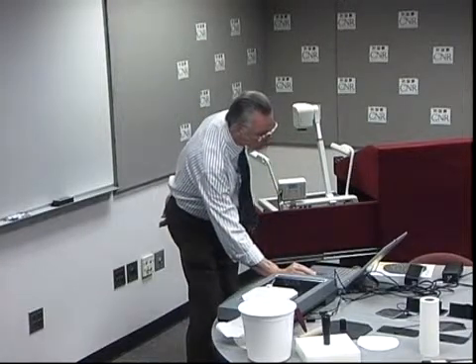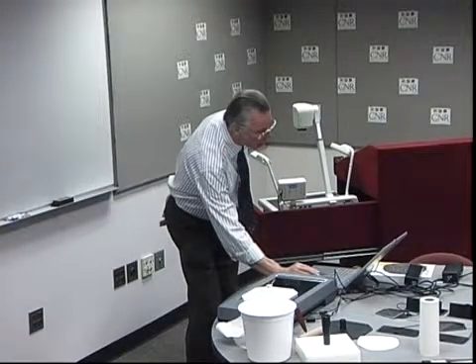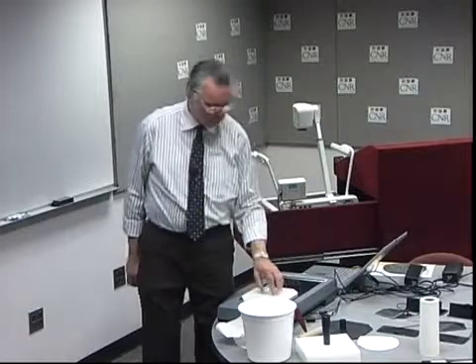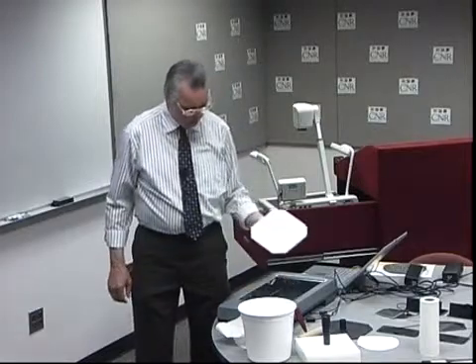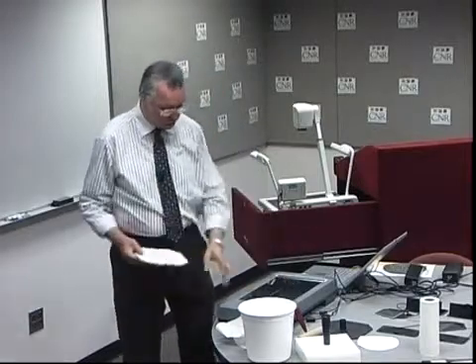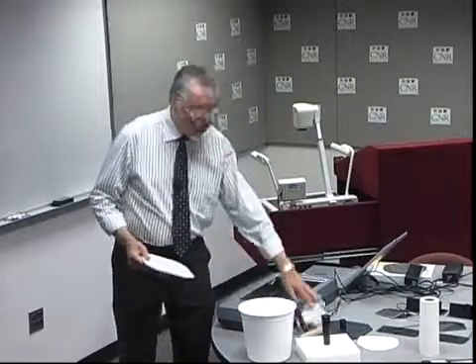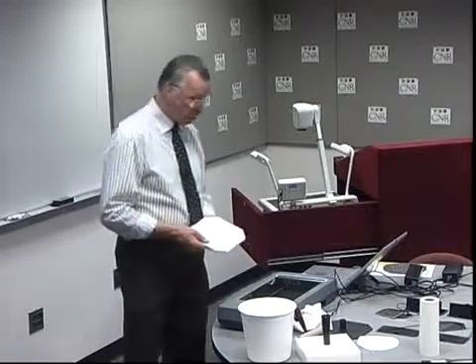There is nothing else to tell you about it. It runs very quickly and very easily. Just run from the wet handsheet for process control. Bill, I think we're finished from the Stickies measurement.